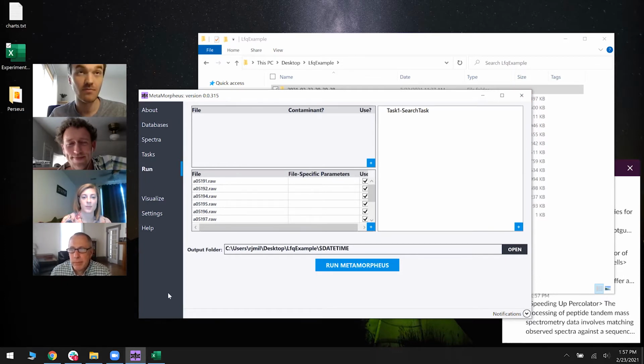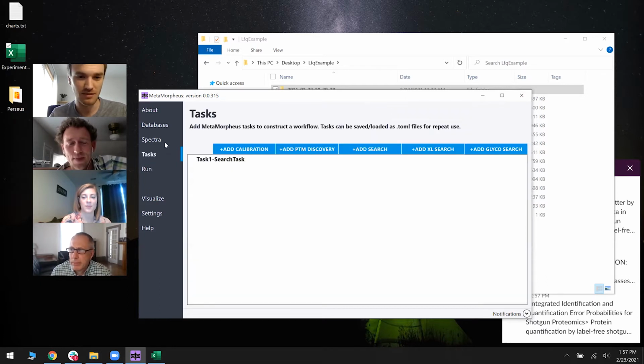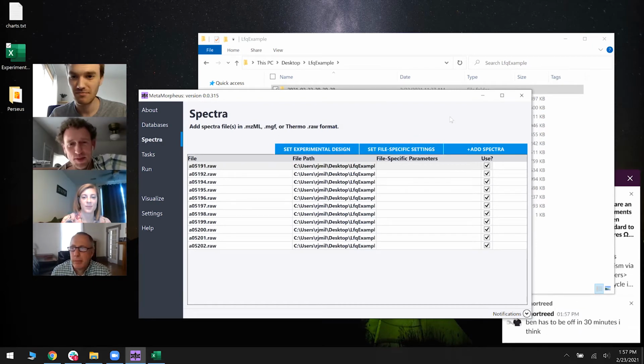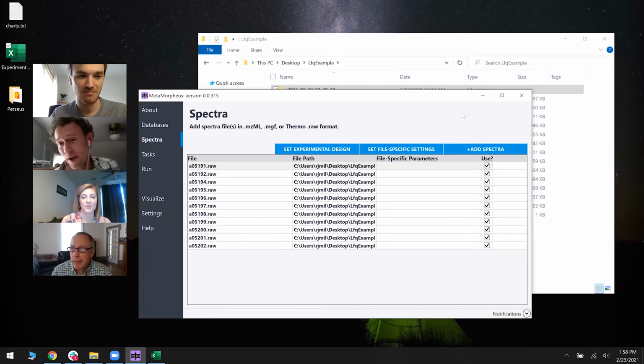Do you have any questions about setting that up? No, I mean, you're explaining it well. You're hitting things that I wouldn't have even asked, like whether or not it was median or mean centered. So yeah, I appreciate that.